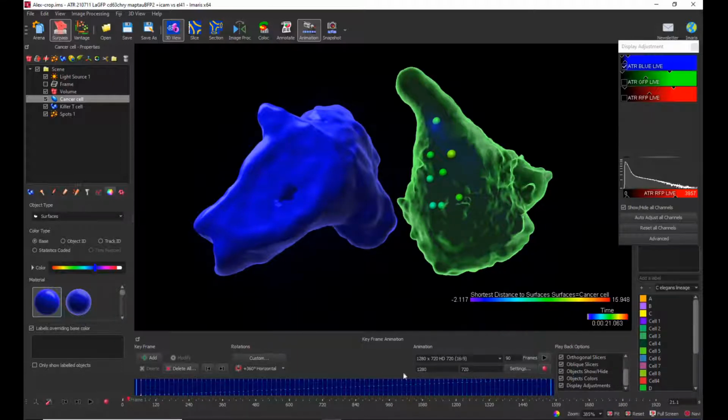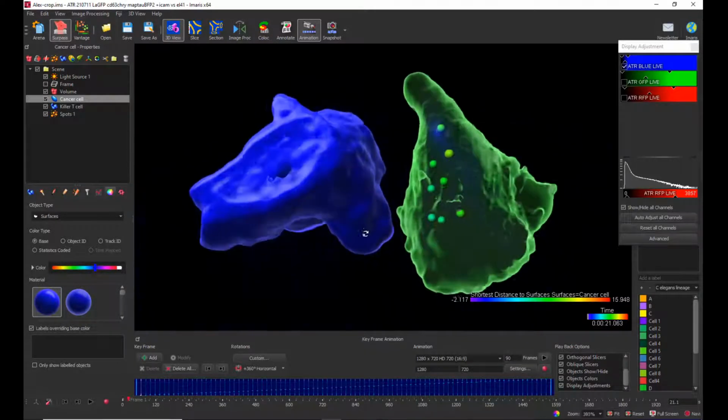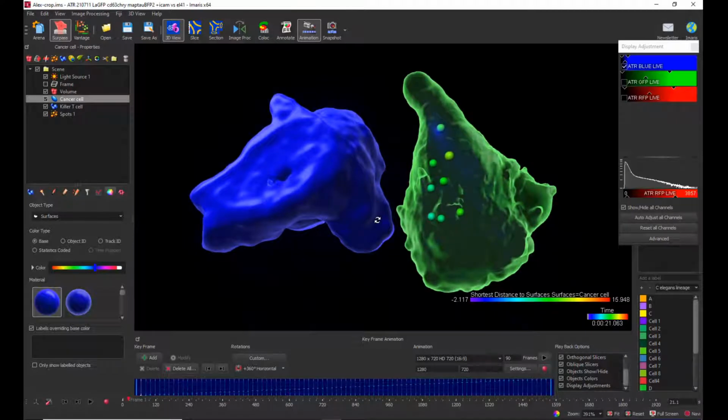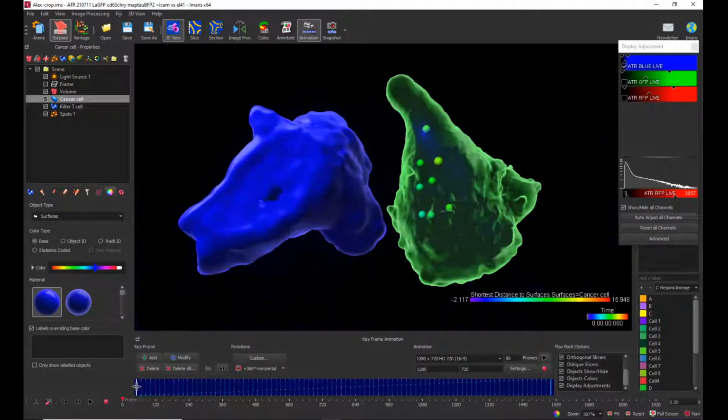But I just wanted to show you a few modifications you can do. With the time lapse, you have to make sure you don't do too many rotations, movements, or modifications, because if you make too much movement in the time lapse, you don't recognize which movement is internal and which is added. So sometimes it's even better to keep it as it is, but there are occasions that you want to zoom into a specific place or something. So I just want to show you how to do it.